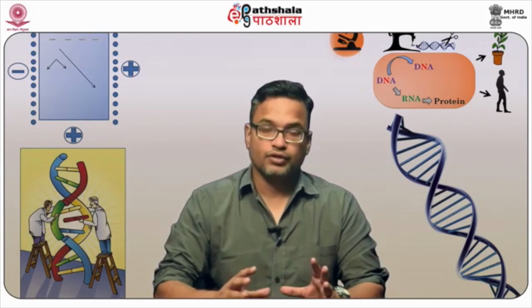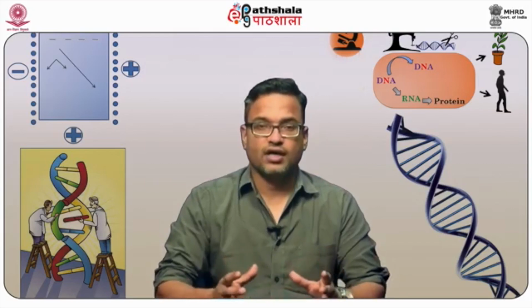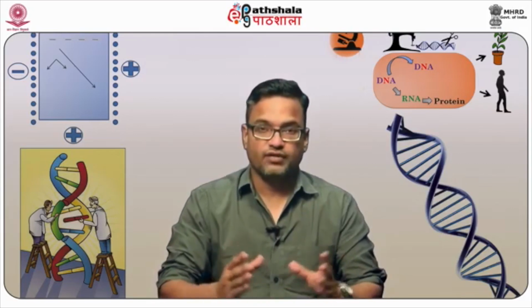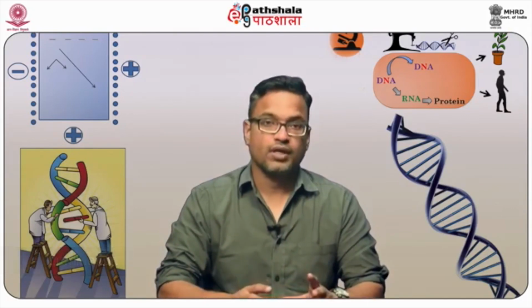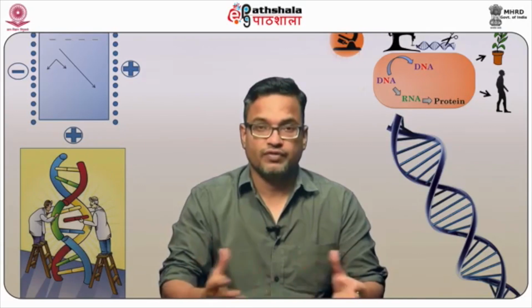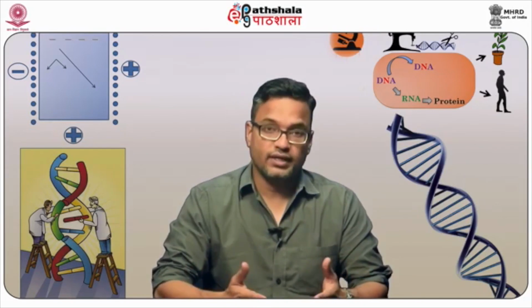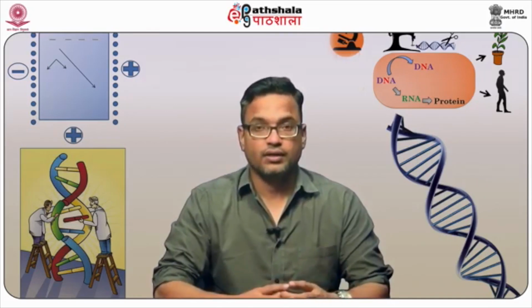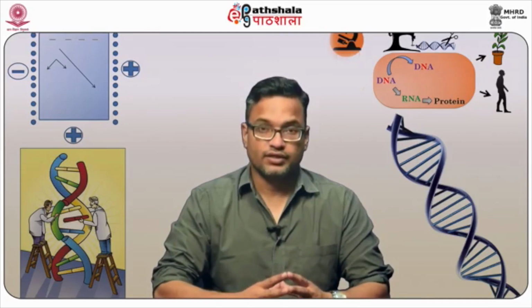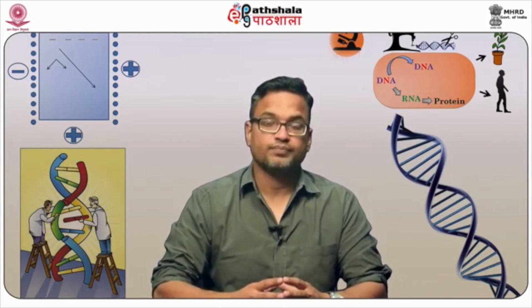Microscopes utilize light, because if you want to see an object, you cannot see it in the dark. You need an object which is well illuminated. Illumination of a sample can be done using natural light, which is provided by the sun, or it could be visible light, or UV light, depending upon the application we are interested in, and this will be discussed in a future module as well.